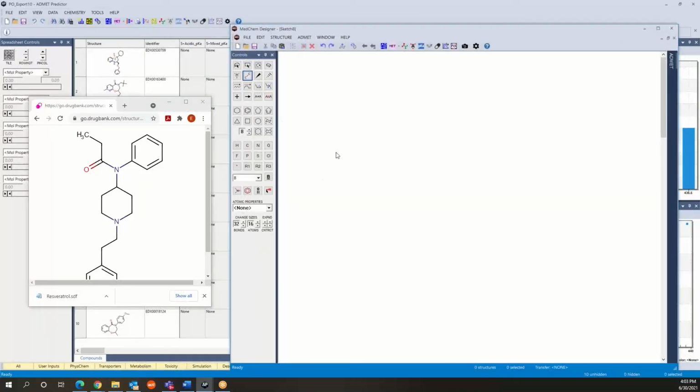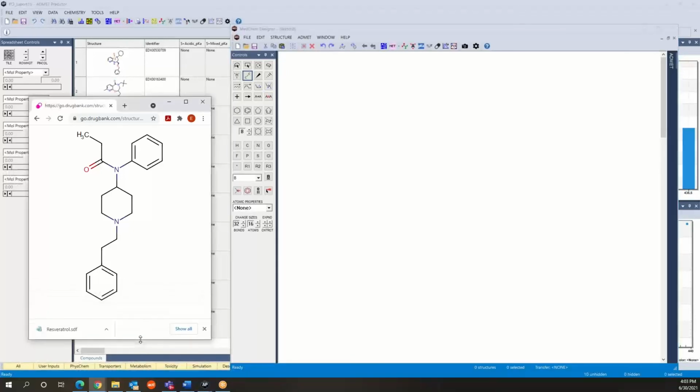So we would start by building the carbon backbone. Maybe put it in full here. So first carbon, second carbon, third carbon. Now we're going to bring a cyclohexyl ring. We'll worry about the heteroatoms later. We go back to our bond tool. Again, sketch the carbon backbone. Now we're going to sketch our carbonyl. And the way you get a double bond is simply click in the middle of the single bond. It'll turn it into a double bond.